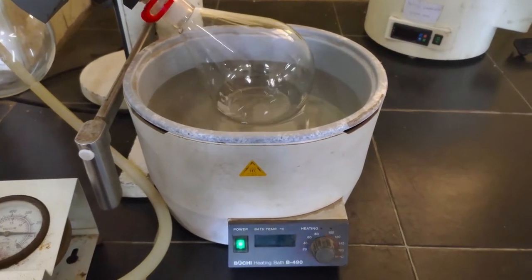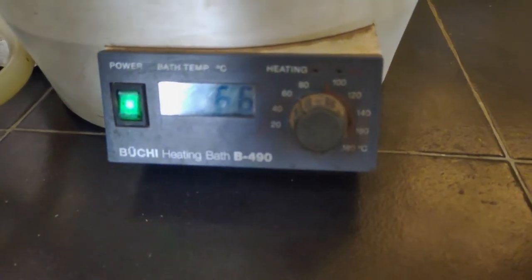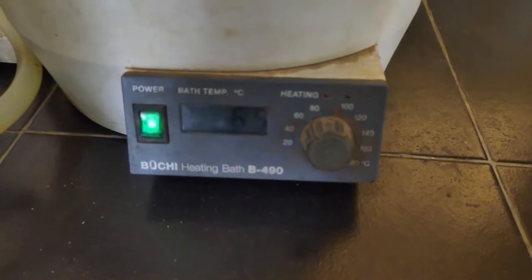This is the heating bath. We can adjust the temperature of the heating bath here. And we have the flask. In the flask, we take a sample along with the solvent.